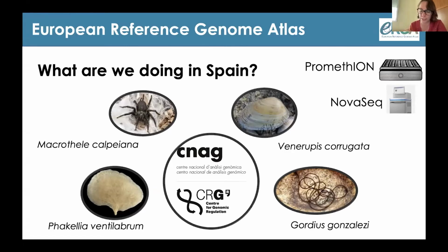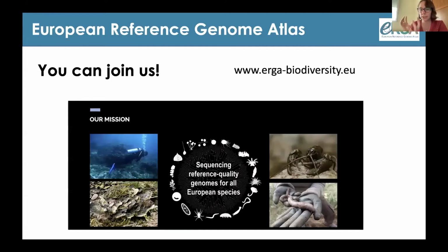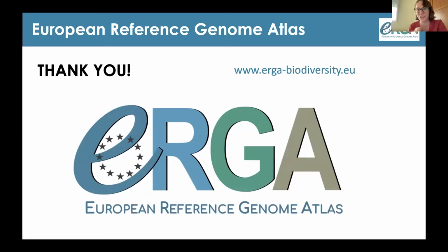So we have already started them, and we plan to sequence them with PromethION, with Nanopore, and with NovaSeq Illumina platforms. This is not a closed project or a closed initiative. We welcome all people. So if you are interested in this initiative, you can join us here in this website. And that was all. Thank you very much.